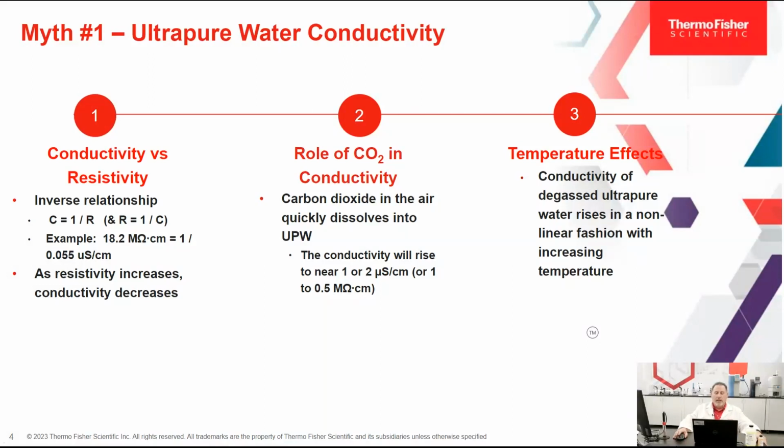We will want to record the temperature and consider using temperature compensation when doing the measurements, adjusting that reading to 25C, depending on the criterion we are comparing to. If we do choose to use temperature compensation, we'll choose a nonlinear temp comp correction that's suitable for pure water.